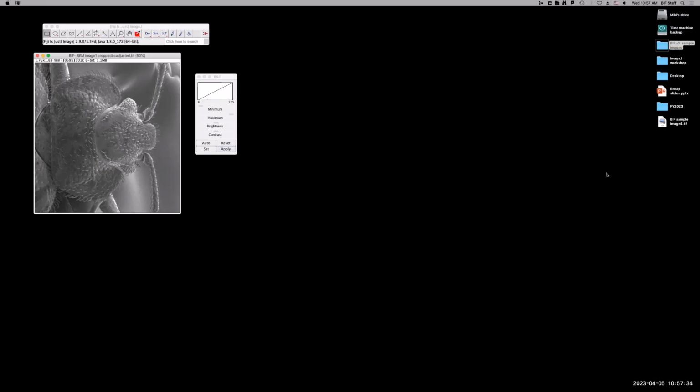For the adjustment, you can also use the maximum. You can make your image brighter as well. So not only the minimum, but do not run outside the histogram, so as not to lose pixels.